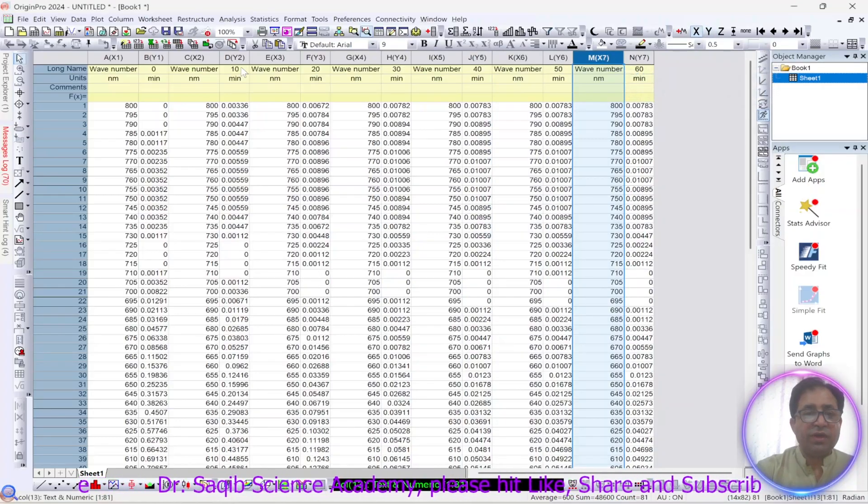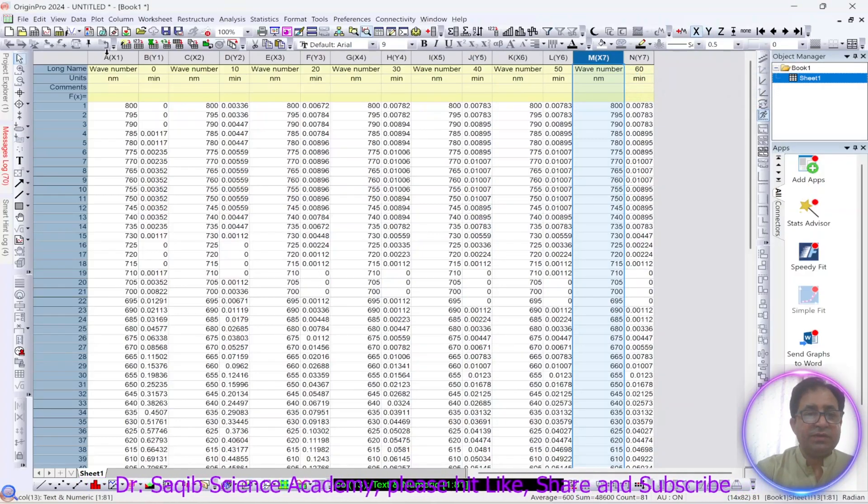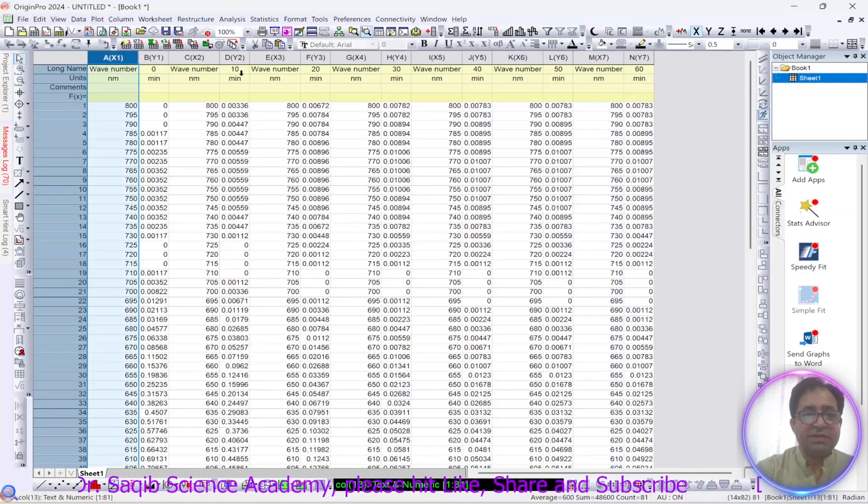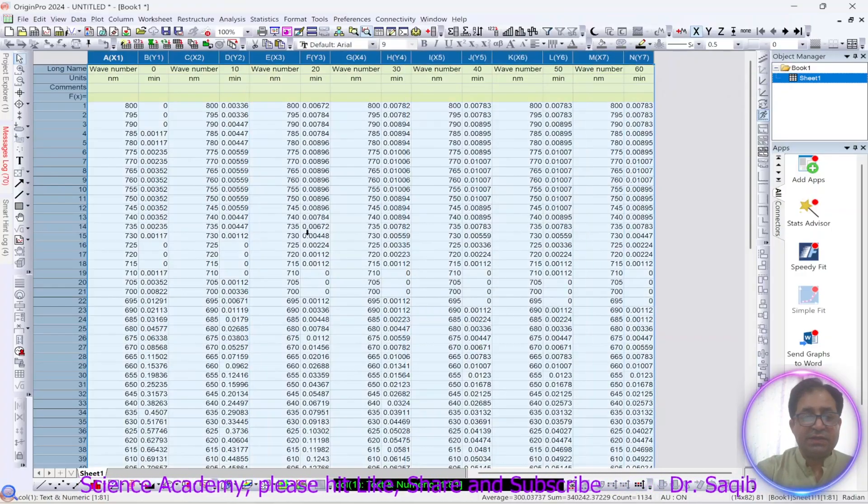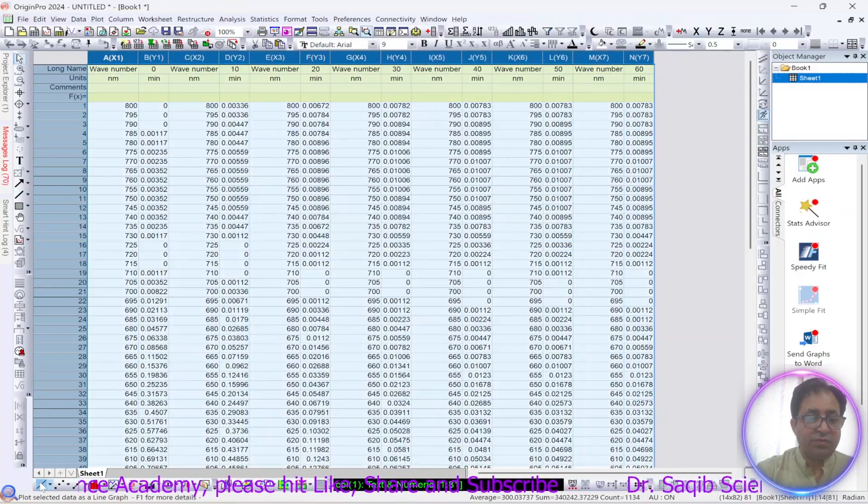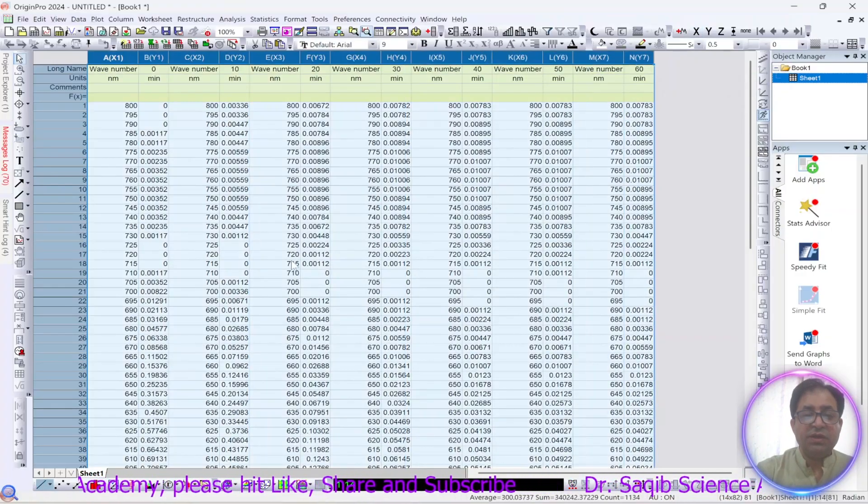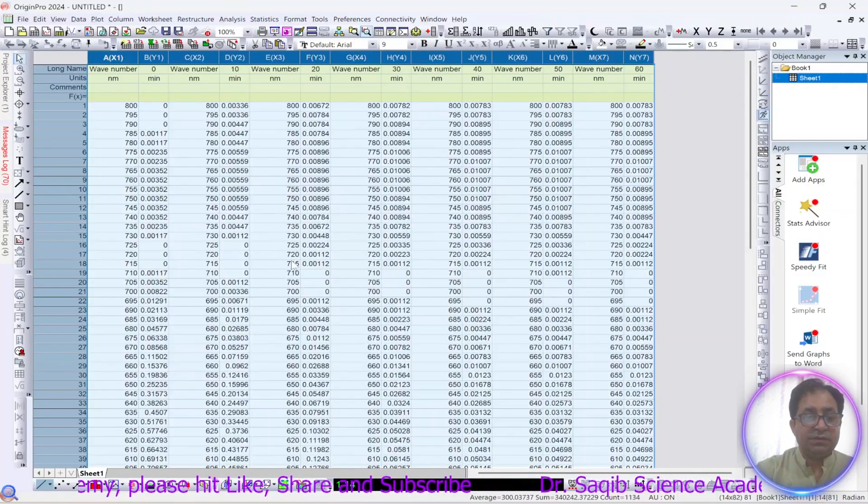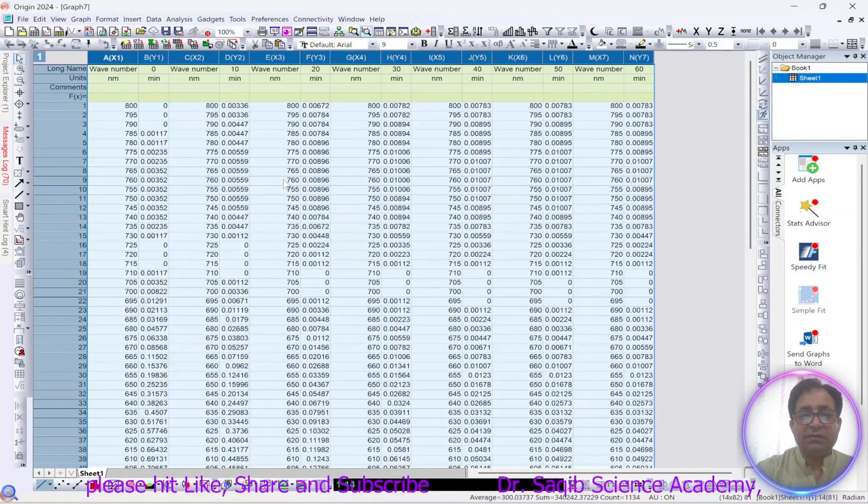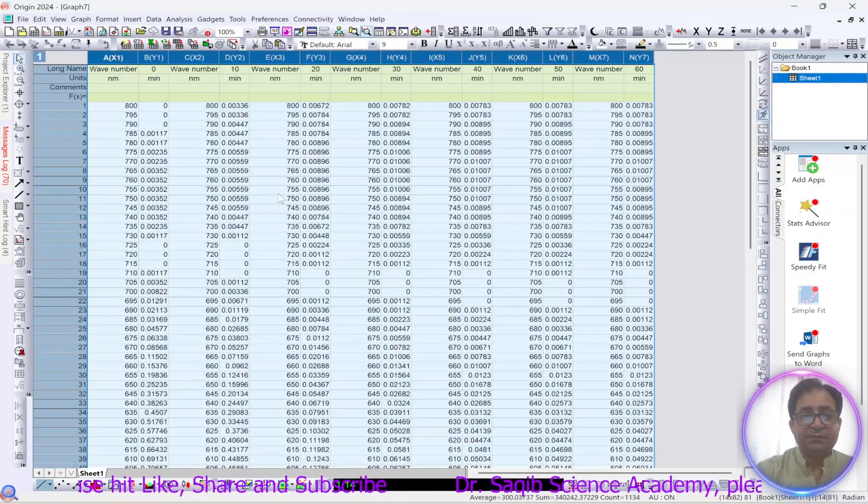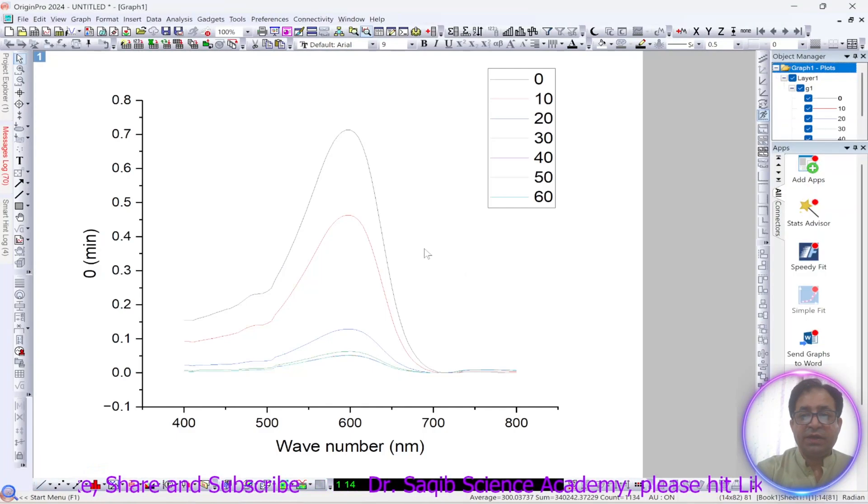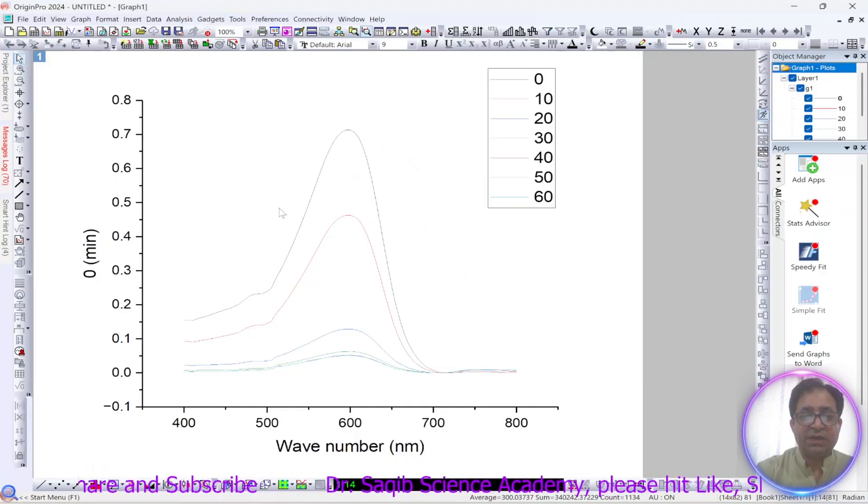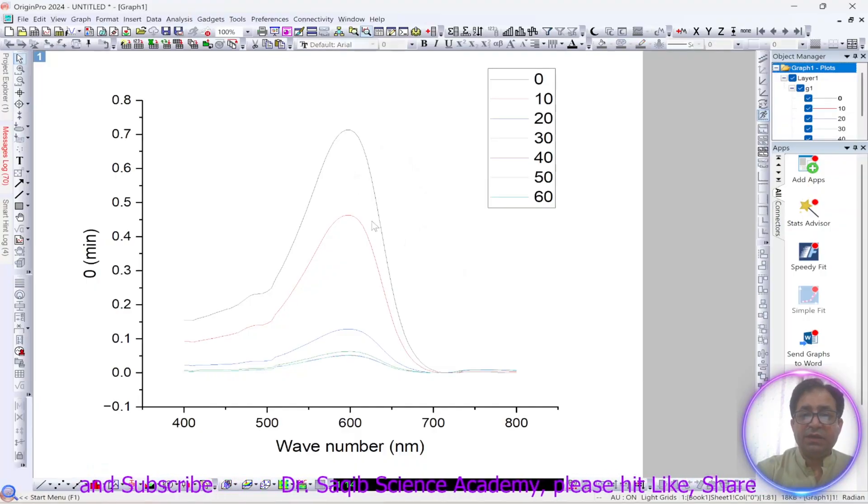So we have set our x axis, we will select this and now we will go for the line graph. So after this you will get this kind of line graph.